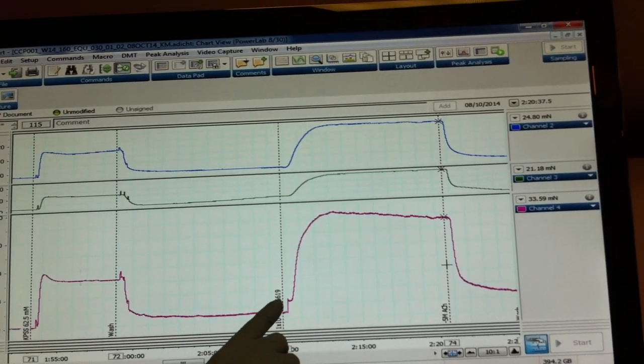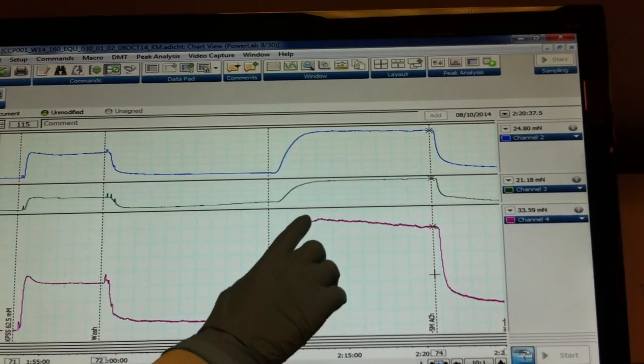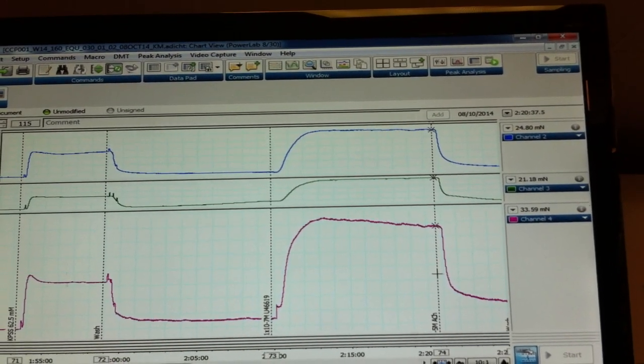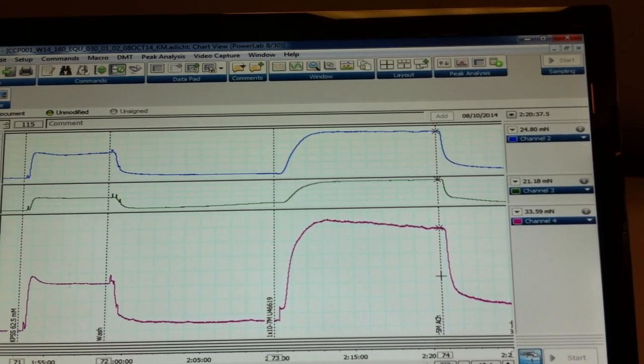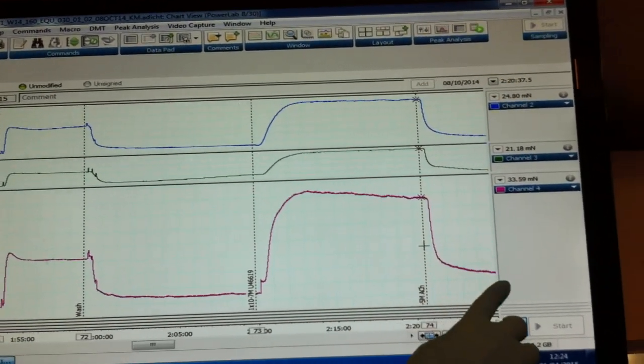Again, once we have a steady baseline response, a contractile mediator is added to cause constriction, demonstrated here. And then endothelial dependent relaxation is assessed using acetylcholine to cause the relaxation demonstrated here.